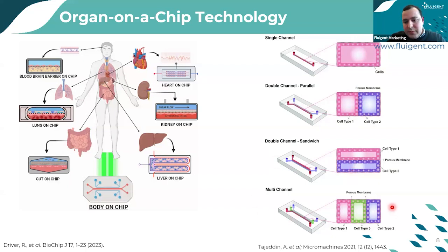And finally, we can combine the 3 models that we have, and we'll have the multi-channel. Of course, it will depend on the application. So basically, depending on the experiments, the goals, the aim that you are searching for, you can choose which model would suit you the best.